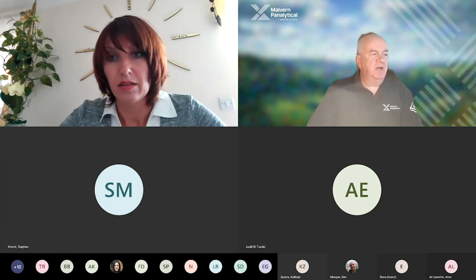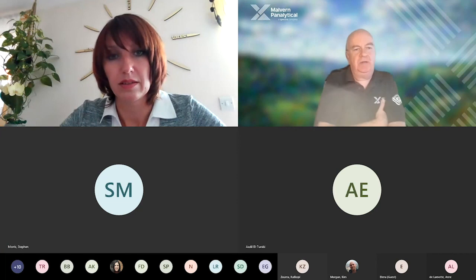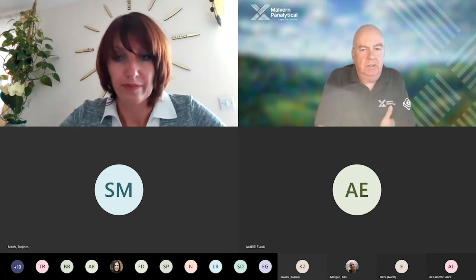Sorry, I would just say if it's a 40 kilodalton protein, it's a pretty small protein. It's only going to be a few nanometers. And correct me if I'm wrong, Agnieszka, but I don't think that's an NTA application. I think that's more a DLS one.